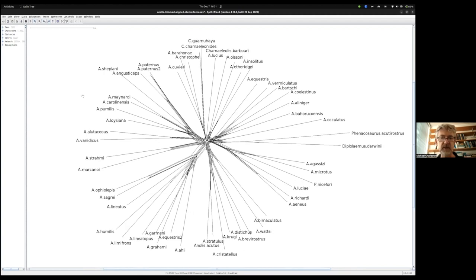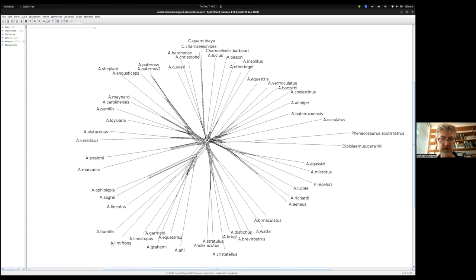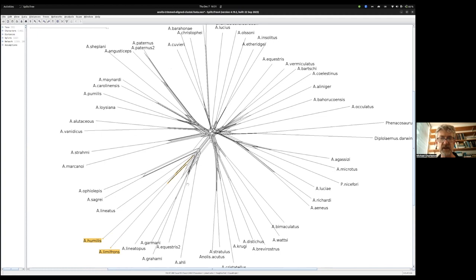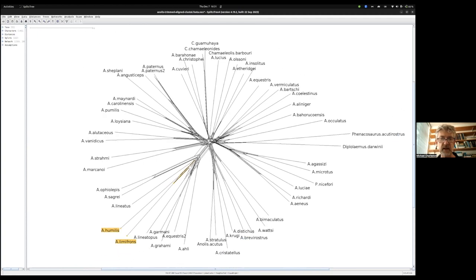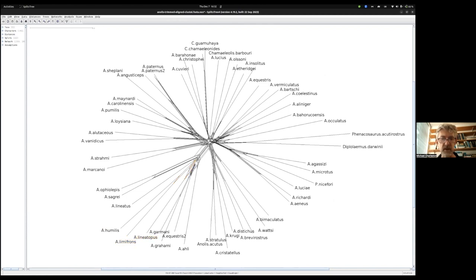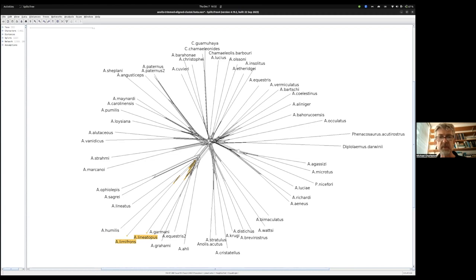We're interested in what's happened to that clade we were interested in before. So A. humulus, A. limifrons, and A. lineotopus. If I click on that split, this is the amount of support for humulus and limifrons being together. That's still there. And there's a certain amount of support for the other split which puts limifrons with lineotopus.